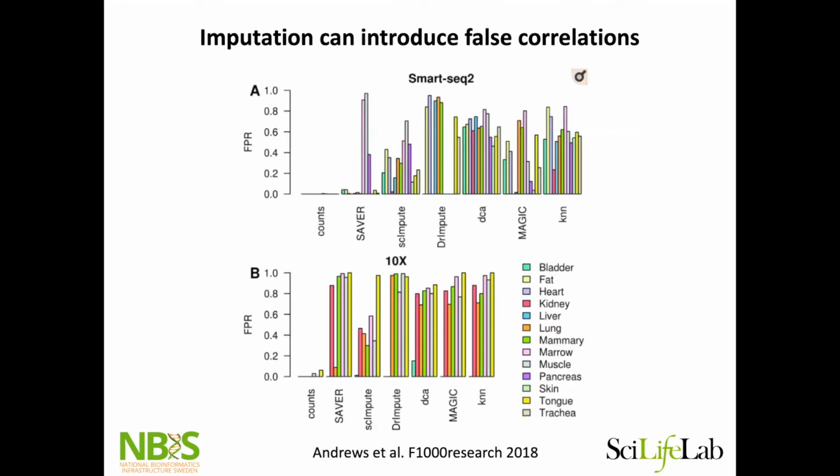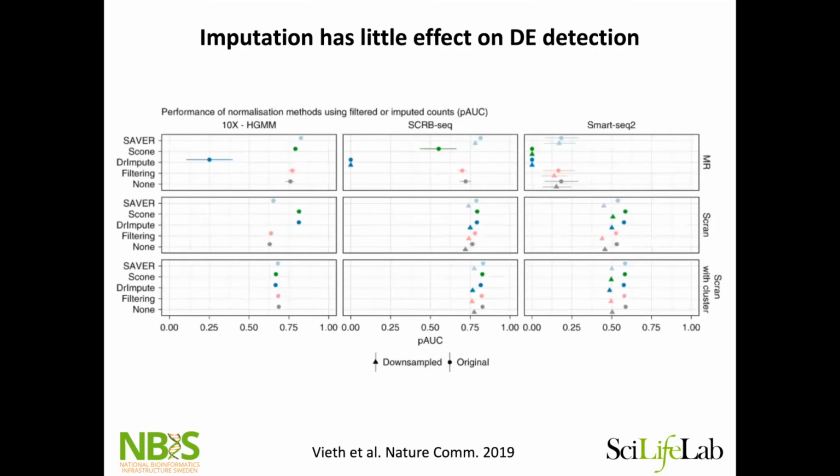However, there have been quite a few papers now showing that imputation can introduce false correlations, but it doesn't affect differential expression that much.